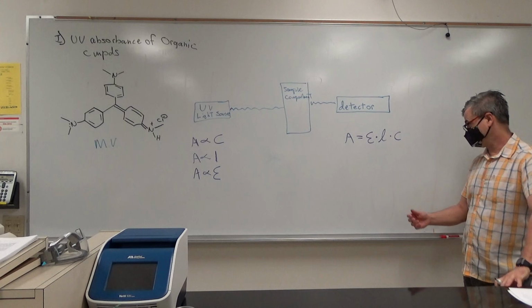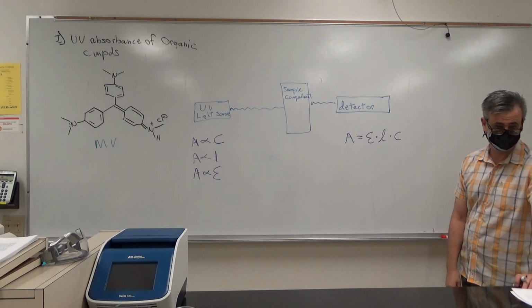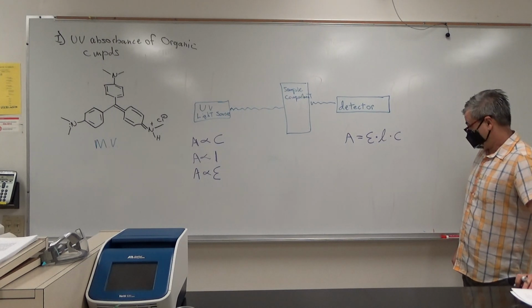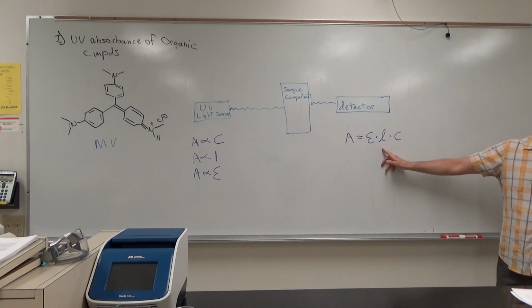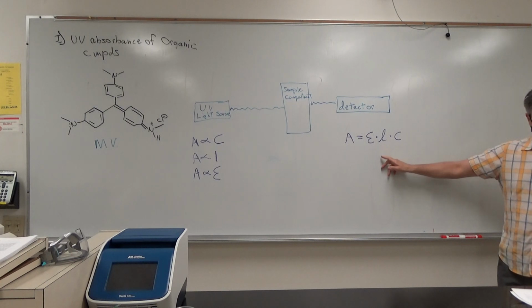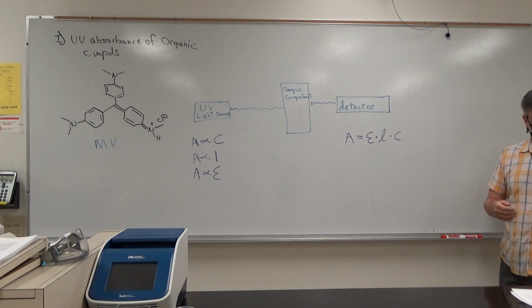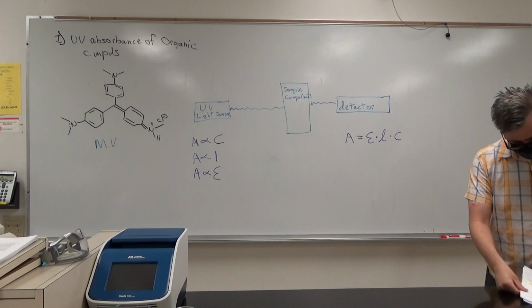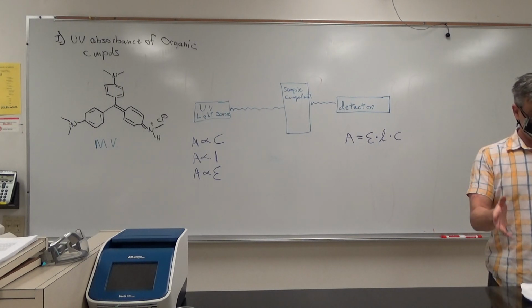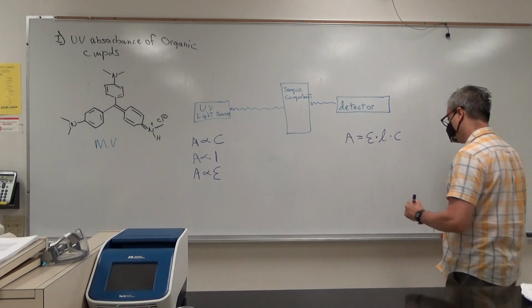All right. Okay, so we can do that, because that's a constant for each compound. And the path length will be a constant for your experimental situation as well, I should mention. The length of your cell path is the length of your cell path. We tend to use the same value of this. Most machines are designed so that it is one centimeter.